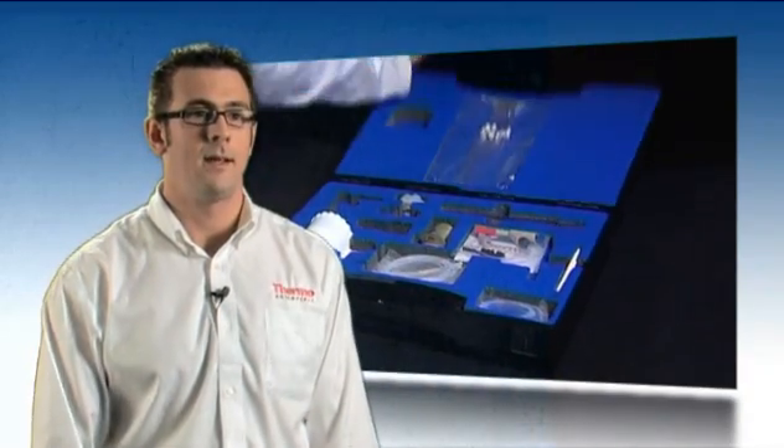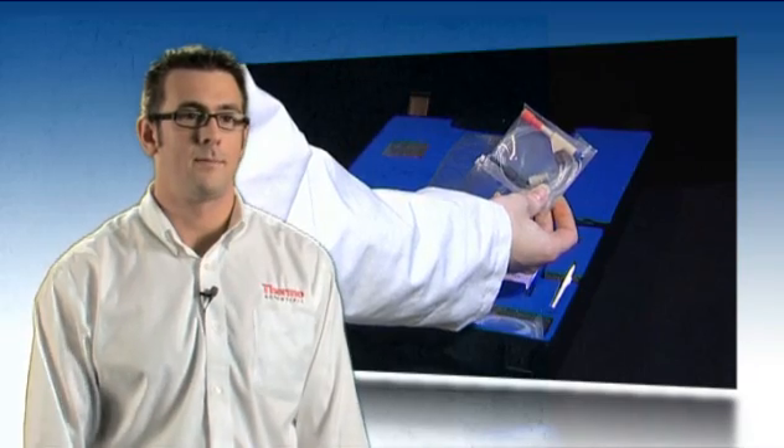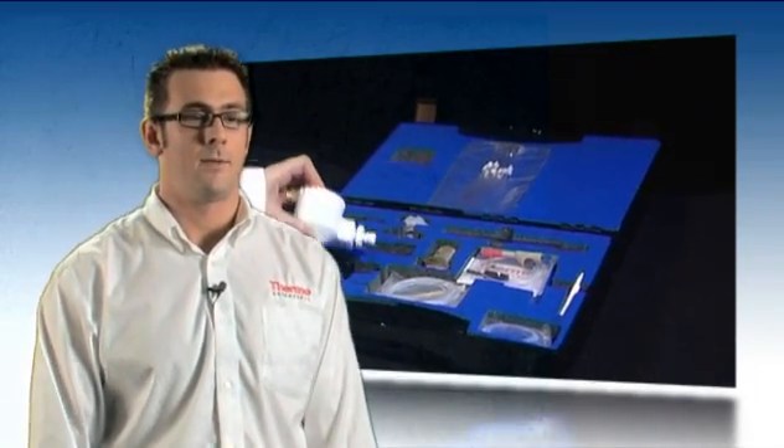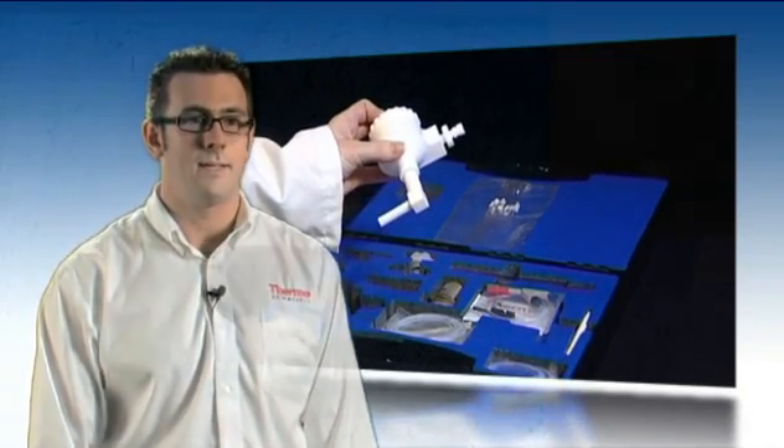The iCAP provides a wide range of sample introduction kits, which really enables the customer to customise the sample introduction system specifically to their needs. We have kits available for aqueous samples, hydrofluoric acid samples, organics, high solids — a whole range of kits that really make it very easy to configure the instrument the way you would need it.